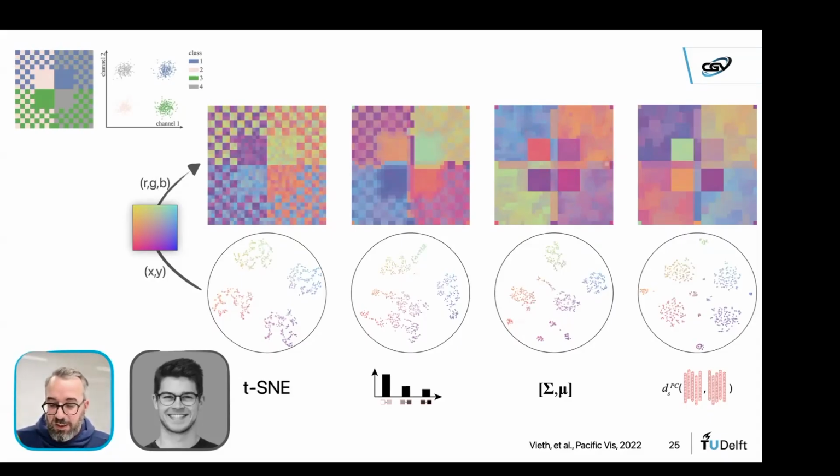On top of this, we also get a bit of the boundaries in between. It's not quite clear if we really need those, but just to be direct, that's what we see in these crosses, right? But generally very nice, right? So we now see this kind of extra image structure in our embeddings and can reason on this.